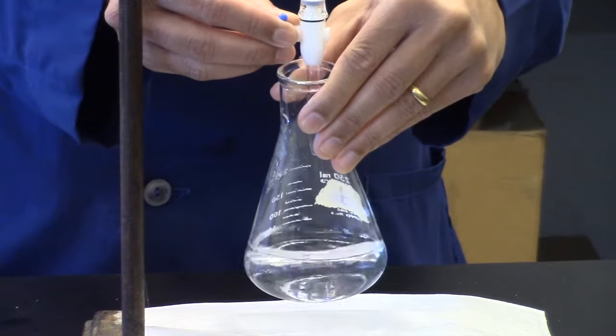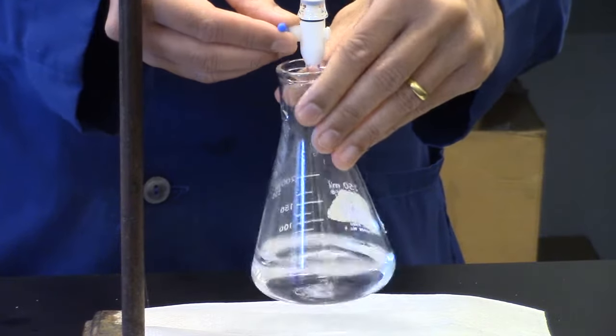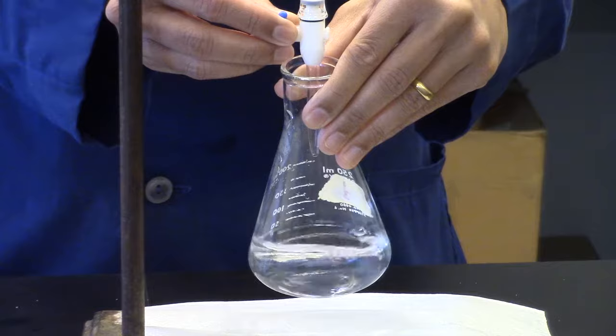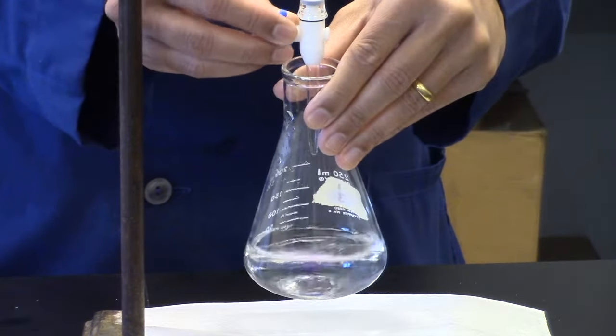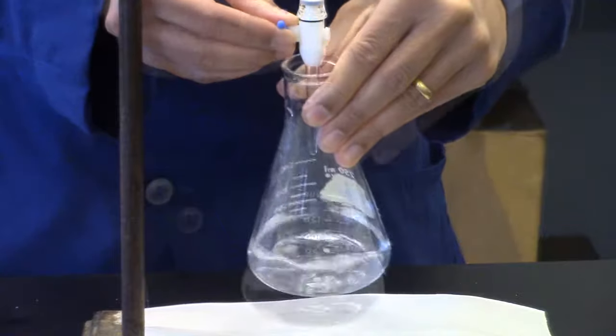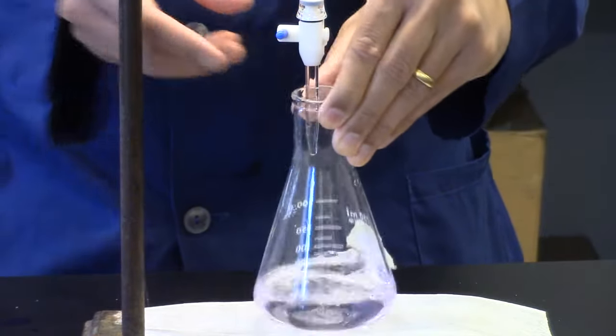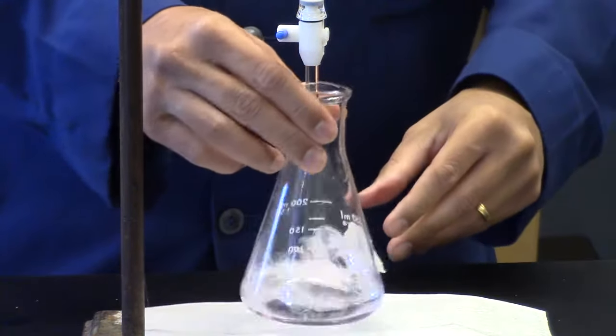At this point, add sodium hydroxide by the drop until you get a pale pink color endpoint. At the perfect endpoint, the pink color will disappear after 30 seconds.